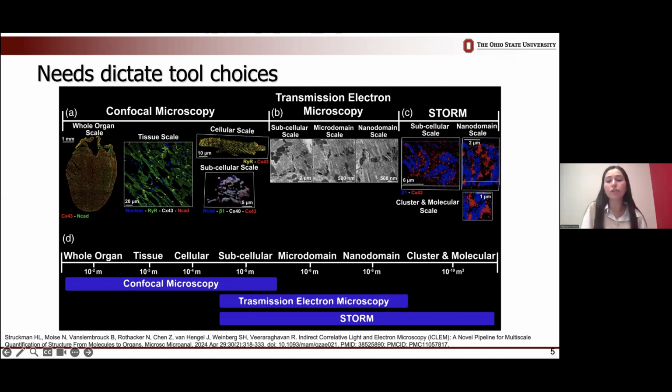We can transition to other higher resolution methods, such as TEM, but with TEM, we're not able to tag and visualize proteins. Therefore, we're only able to look at cardiac ultrastructure with this method. We can also transition to other super resolution microscopy methods such as STORM. STORM relies on stochastic blinking events of fluorophores in order to get sub-diffraction resolution. But with this technique, we're still only getting around 20 nanometers resolution, which is still not good enough to answer some of the critical questions we have about sodium channel clustering.